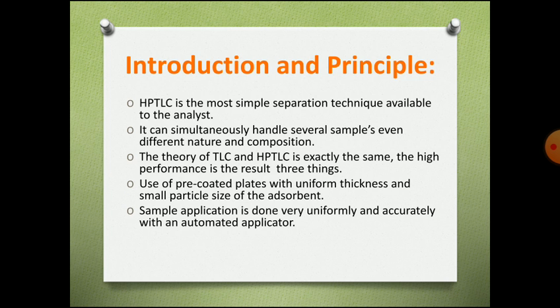That makes TLC very tedious and time consuming, but in HPTLC the instrument does this sample application in a few minutes.